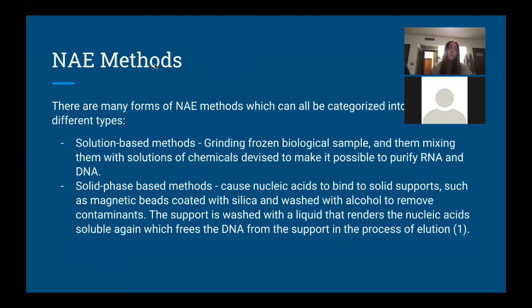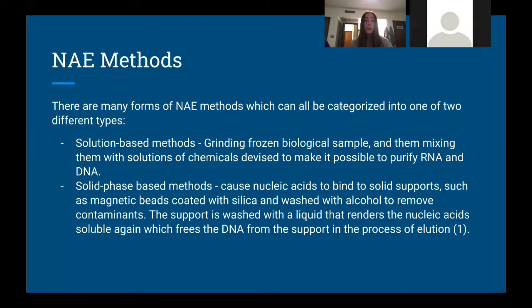And nucleic acid extraction methods. When looking closely, there are many forms of methods, and they can all be categorized into one of two different types, either a solution-based method or a solid phase-based method. Solution-based methods involve grinding frozen biological samples and then mixing them with solutions of chemicals devised to make it possible to purify RNA and DNA.